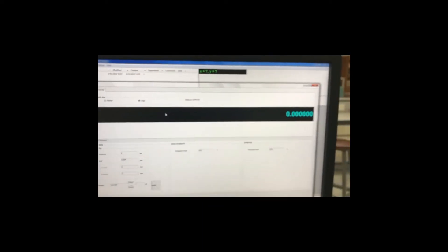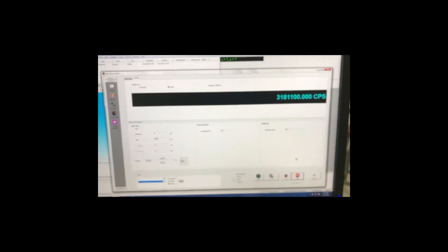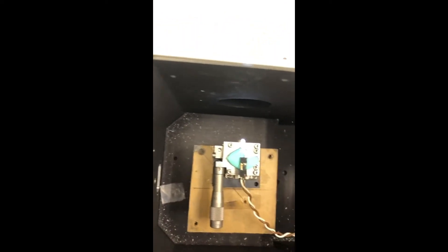This is to show the CPS value. And then click on continuous and then click run. This value is the light intensity for the closest range to the screen. As you can see, we have moved our LED as close as possible to the screen.